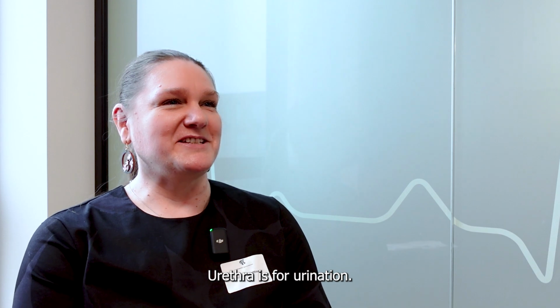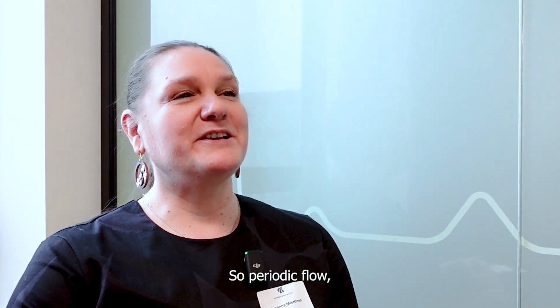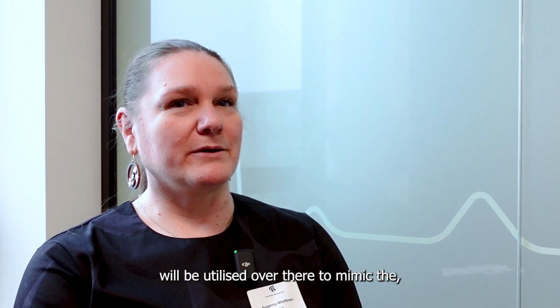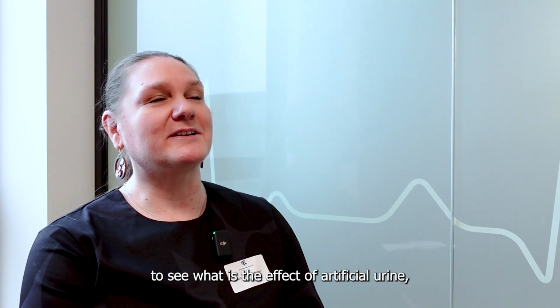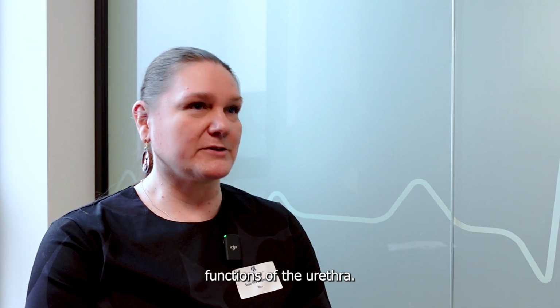Urethra is for urination. So we are mimicking urination over there. So periodic flow, periodic stretching of the urethra will be utilized over there to mimic the mechanical stimulation. In the lumen, we can also utilize artificial urine to see what is the effect of artificial urine to the composition, to the cellular functions of the urethra.